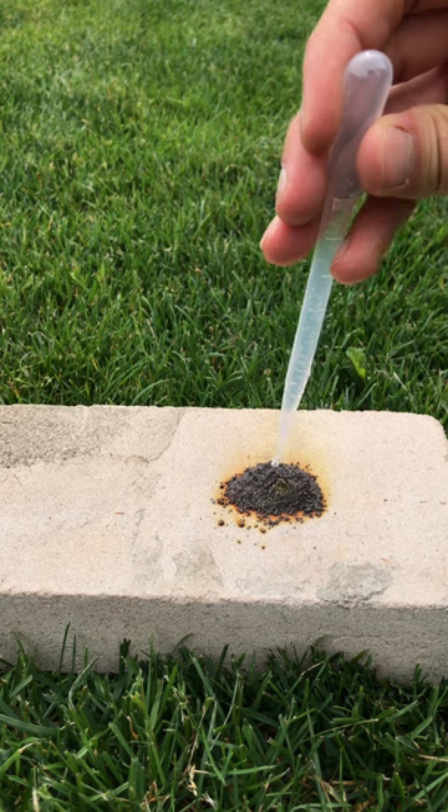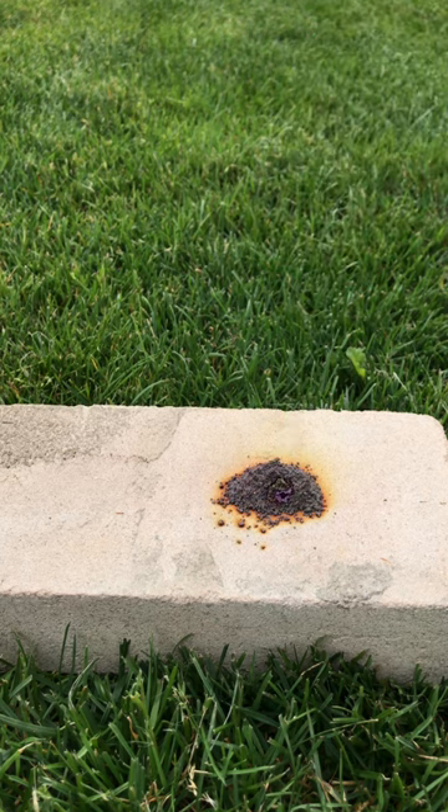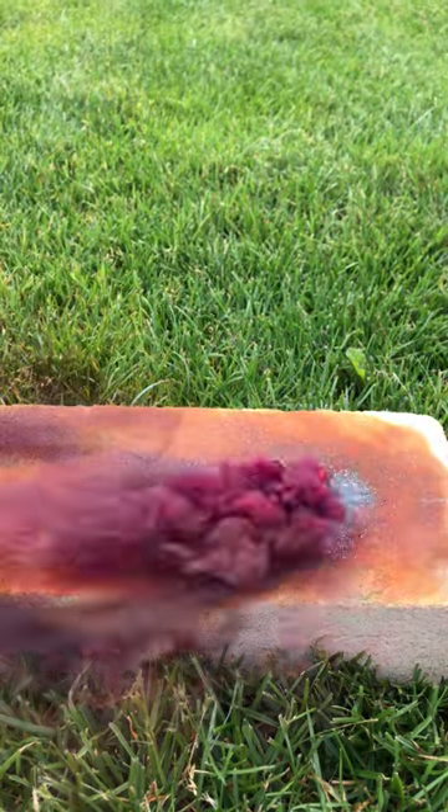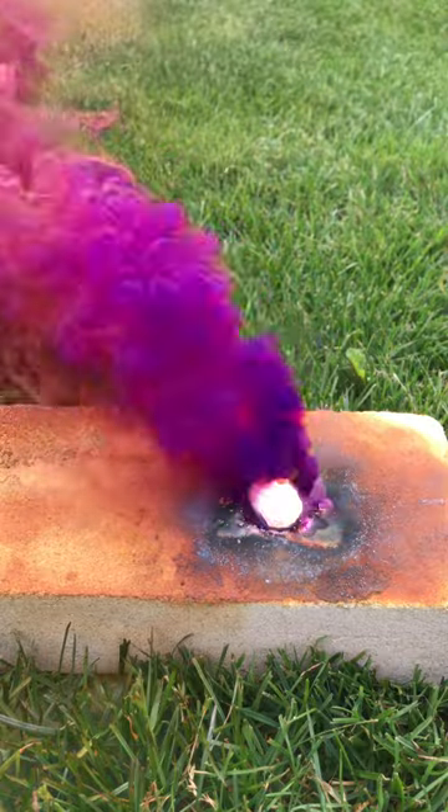You can either initiate the reaction by using a lighter or you add a drop of water. Immediately after adding it, we got a lot of purple smoke. We form aluminium iodide and this is colorless, but the reaction gets so hot that some of the iodine sublimes and makes this beautiful purple vapor.